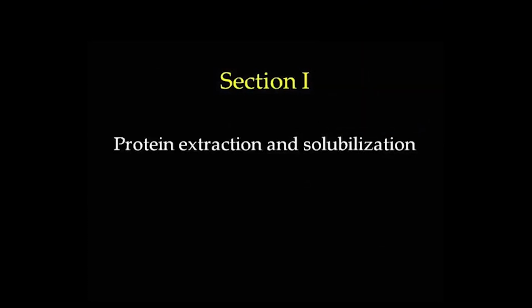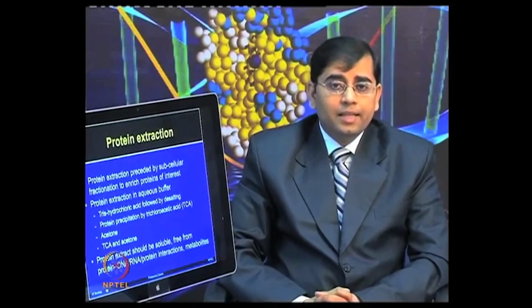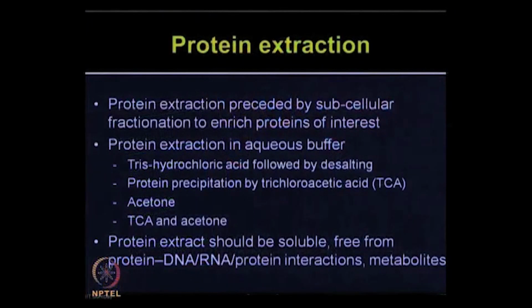So, protein extraction, after performing the subcellular fractionation so that the proteins you are going to be analyzing in your experiment can be enriched. For protein extraction in the aqueous buffer, one can follow different procedures: either use Tris hydrochloric acid followed by the desalting method, protein precipitation by trichloroacetic acid or TCA, or acetone alone, or trichloroacetic acid and acetone.